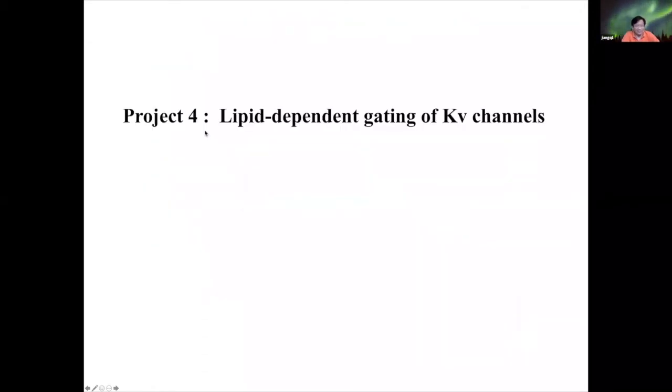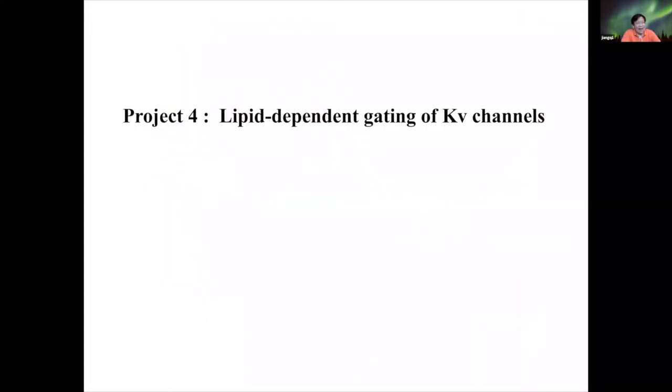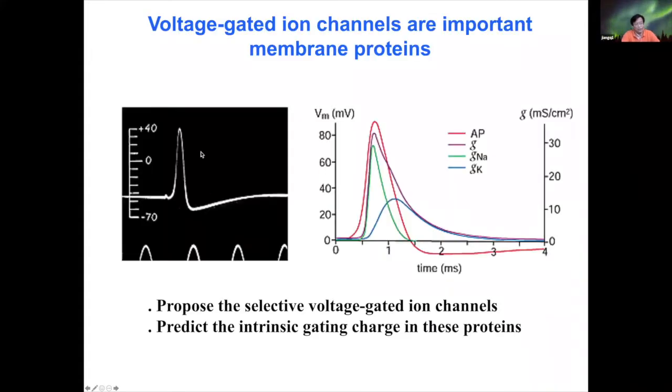So in this part I demonstrated to you that Cryo-EM at different resolution ranges can really help to address very important biological questions in nature. The last part, I will tell you a story quickly about a major discovery we advanced, which we called lipid-dependent gating of voltage-gated potassium channels, or KV channels.